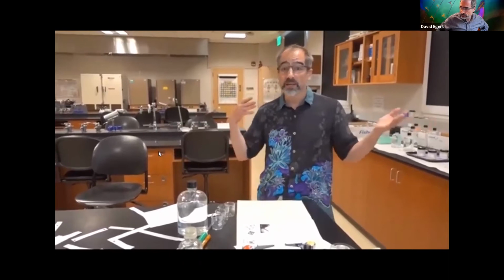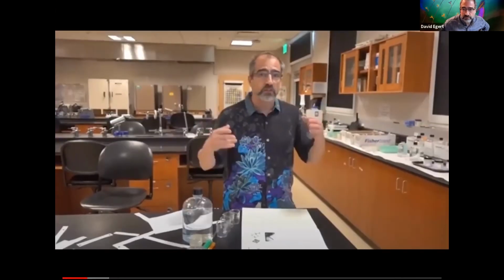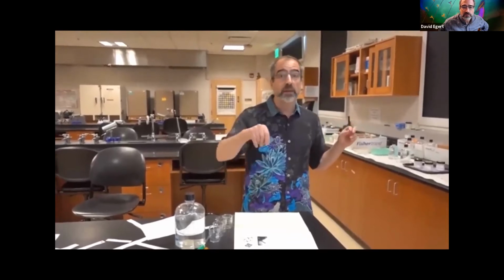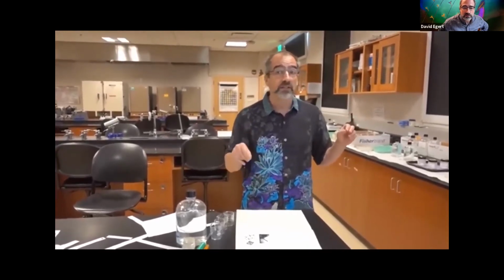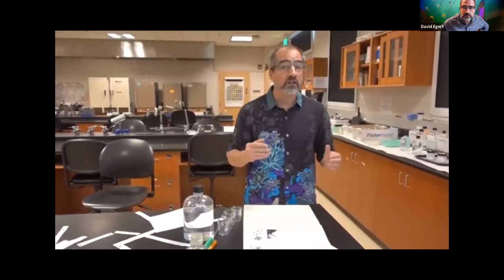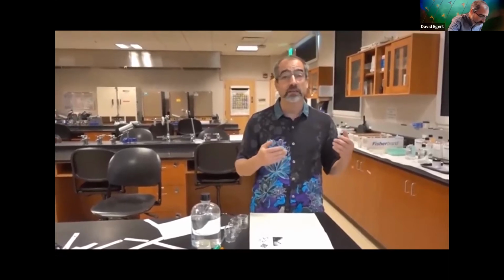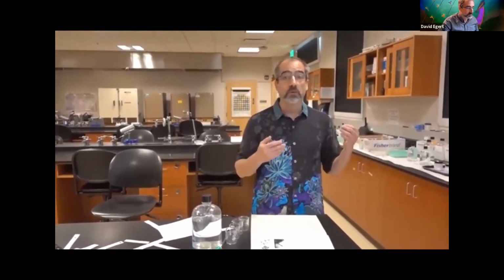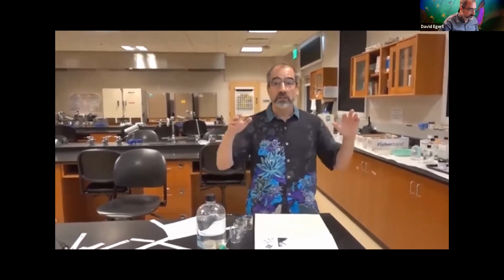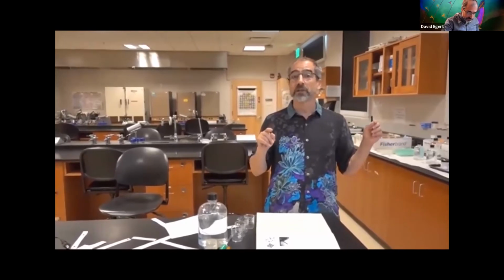And we'll be reviewing the broad overview of how the lab goes. But even if you think you know what you're doing, you still got to slow down and read step by step, because there's often subtleties. Also, often we're taking the data from many different groups and averaging it all together. You can't do that responsibly unless every group did the experiment in the exact same way. So as much as you're gung-ho to just get data, slow down and have at least one person in your group who is the official reader, and get more pedantic.